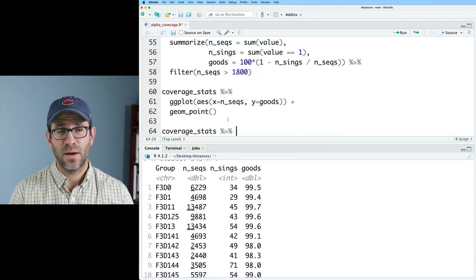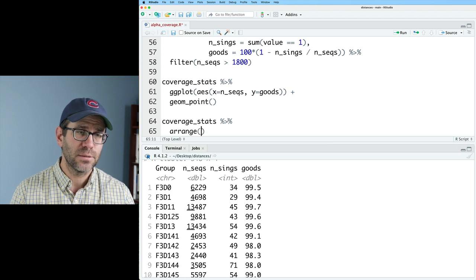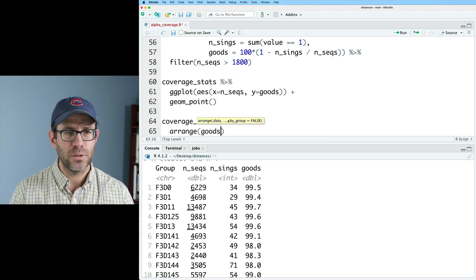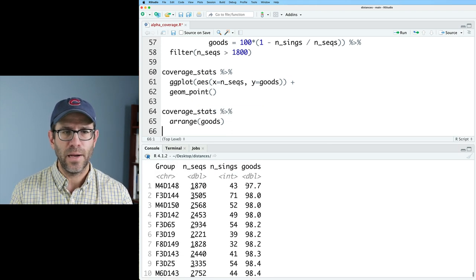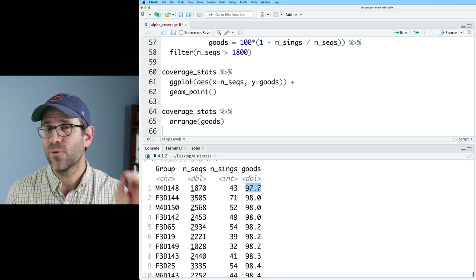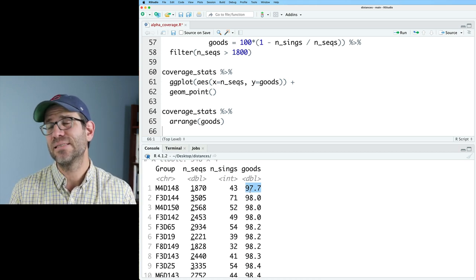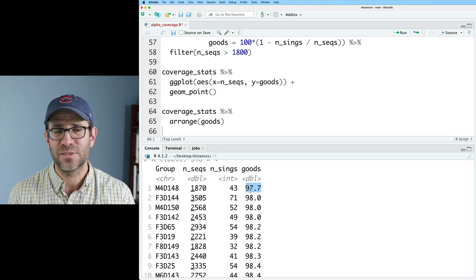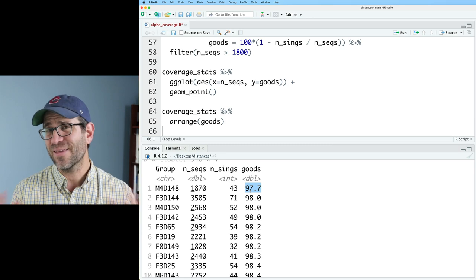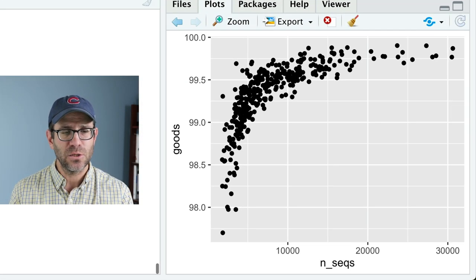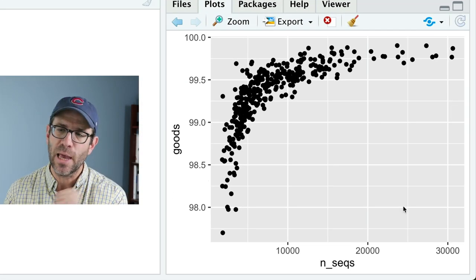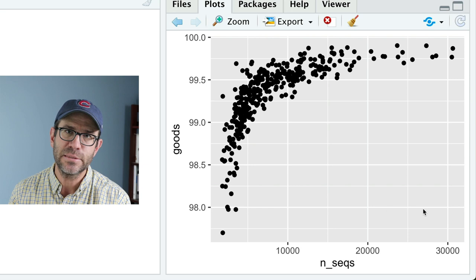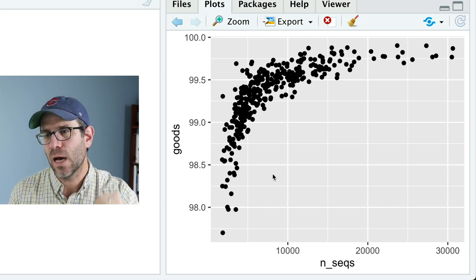And so now we see all of our goods coverage values are over about 97 and a half percent. And so why don't we go ahead and grab this? And I will call this coverage stats. And then we'll take coverage stats and pipe that into here. And again, if we take coverage stats, we can arrange this by goods. And we find, yeah, the lowest coverage if we go to 1800 sequences is 97.7%. I'm really happy with that. I think that's pretty good. And so as we can see, certainly as we add more sequencing depth, our coverage goes up.